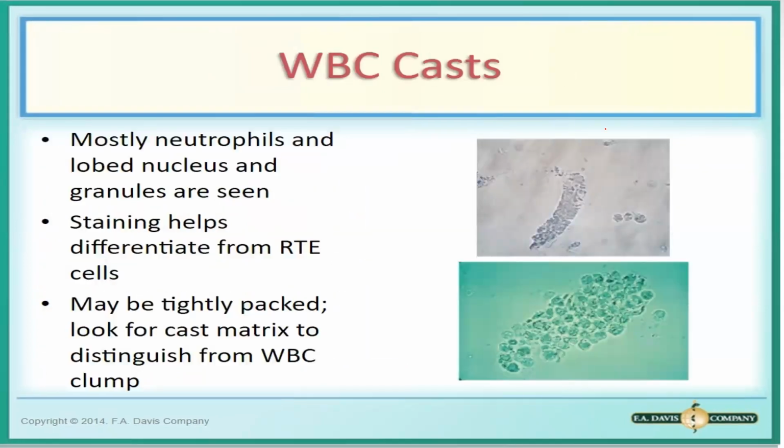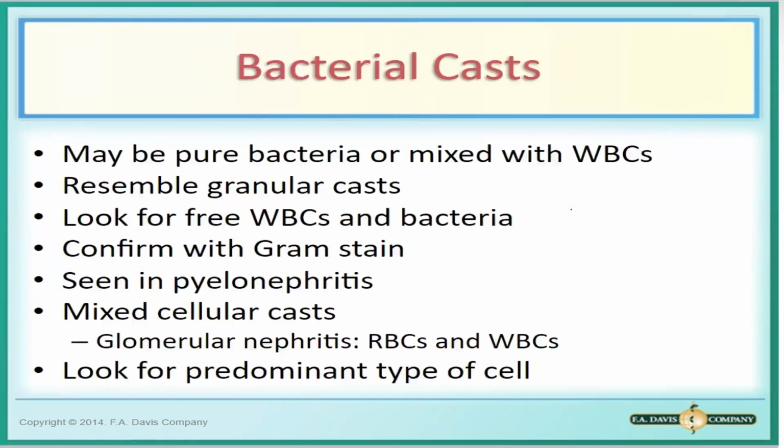Okay. So, in here, for example, in this photo, medyo mahirap na siyang i-identify, no? One way you can identify po is for looking free-floating WBC. So, ito may free WBC tayo dito. Okay? So, malapit siya dito. So, most probably, this is a WBC cast. Okay? So, kapag nahihirapan kayong identify, you can use that technique. Yeah, moving on, bacterial cast. Okay? So, sorry, medyo mabilis ako kung magsalita. Anyway, you can back naman yung video. Okay, so, parang masyado na kasi mahaba yung video.